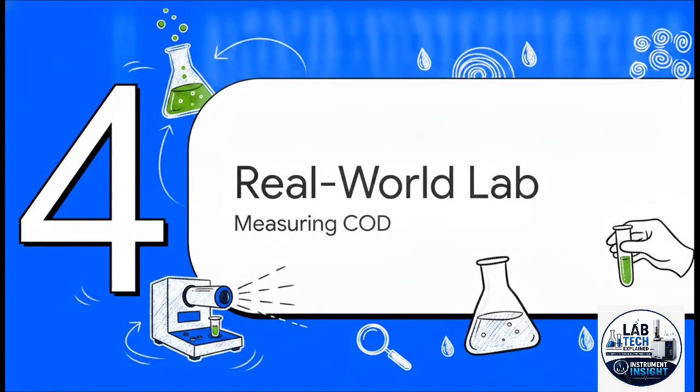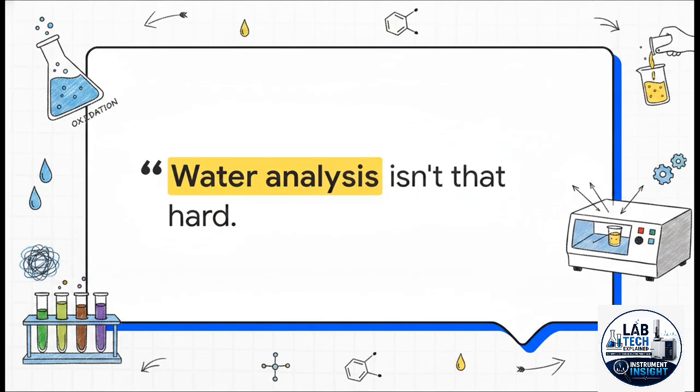Let's move on and see how this builds in Section 4, Real-World Lab, Measuring COD. To see all this awesome tech in action, we're going to shadow a tutorial from Macherey-Nagel, where their sales manager, Matthias, guides us through testing chemical oxygen demand, or COD.